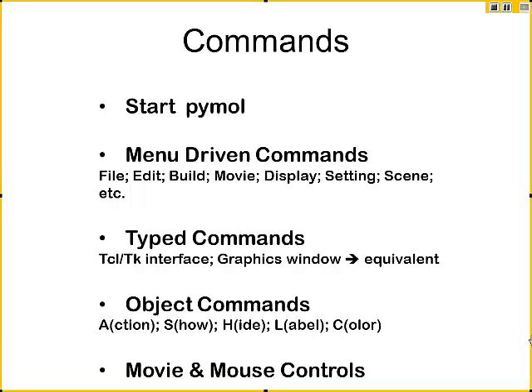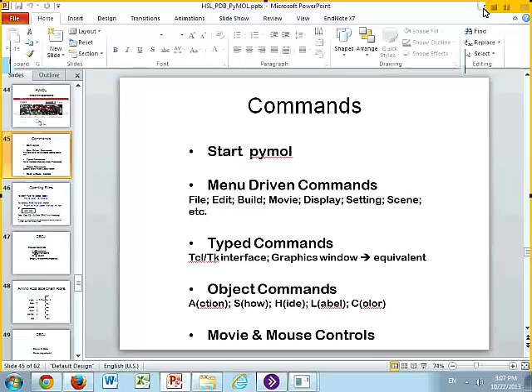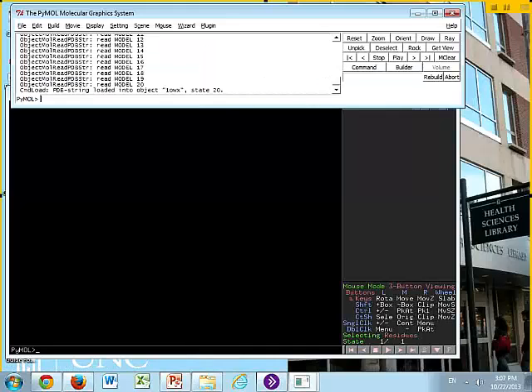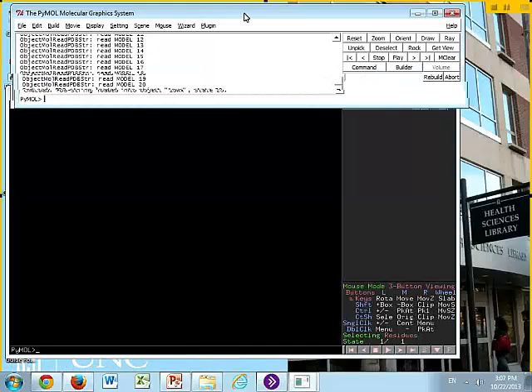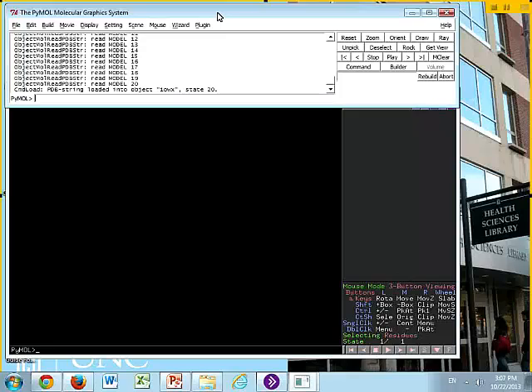Now, there are different types of commands in PyMOL. We started PyMOL, there are menu-driven commands, there are typed commands, there are object commands, and movie and mouse controls. So we're going to go back to PyMOL and let me show you where these different things are.